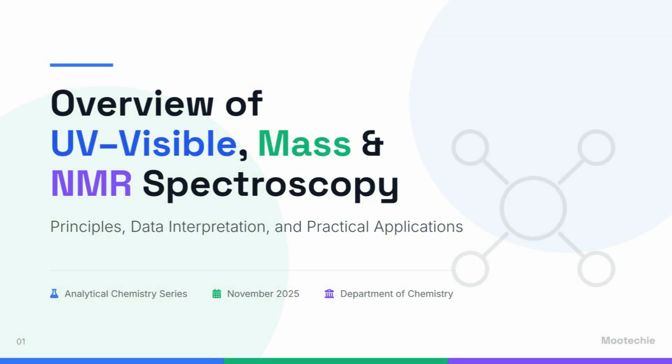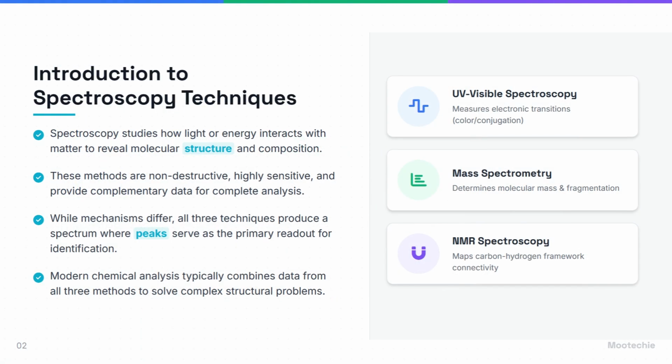Overview of UV visible, mass, and NMR spectroscopy. This presentation covers the principles, data interpretation, and practical applications of these methods. Next, we explore our introduction to these fundamental techniques.